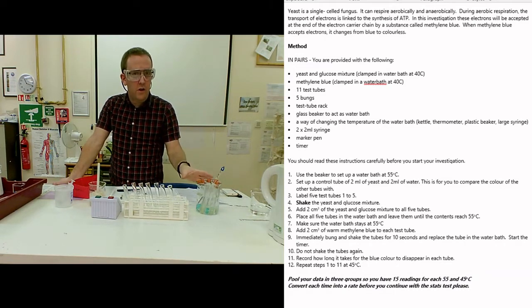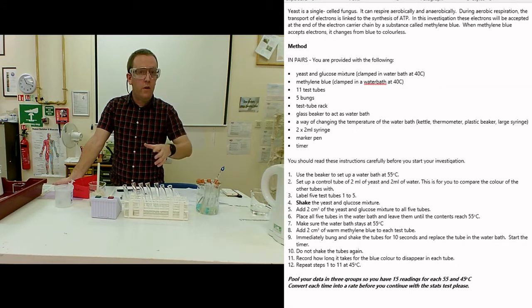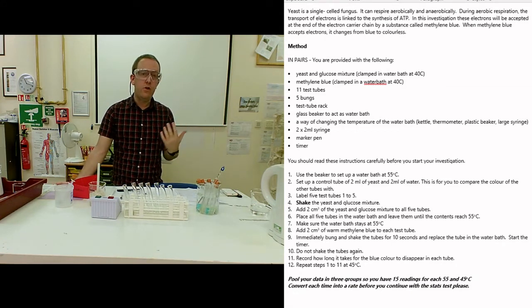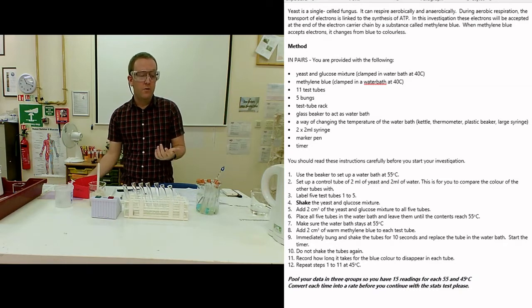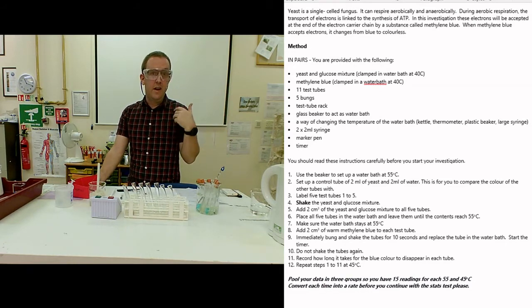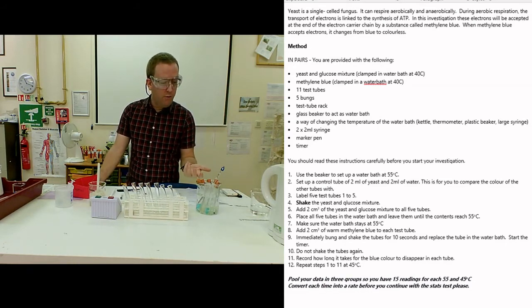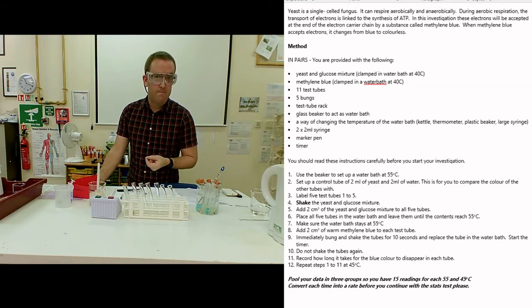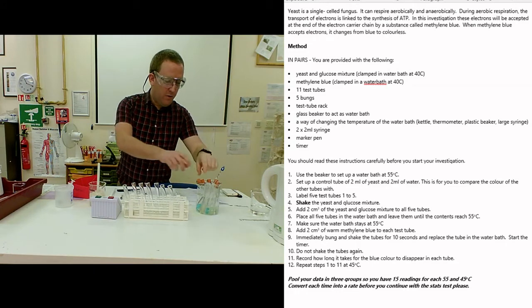Of course, you do that once at 45 degrees C, once at 55 degrees C, getting as many results as you can. You have to do a statistical test on this. Times are not really what we're after - we're after rates. So we do one divided by the time to get a rate, an inverse of the time, and that is what you use to put into your statistical test.